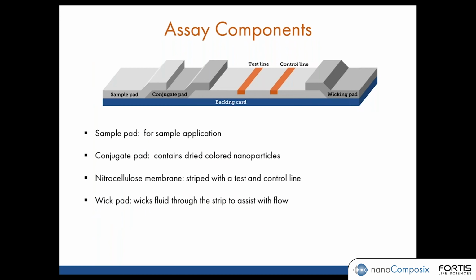Lateral flow assays are simple, inexpensive devices used to detect the presence or absence of analyte in a sample. They're intended for point-of-care use, delivering test results within 30 minutes of sample collection. They can be used in clinics and in the field without expensive or bulky equipment.